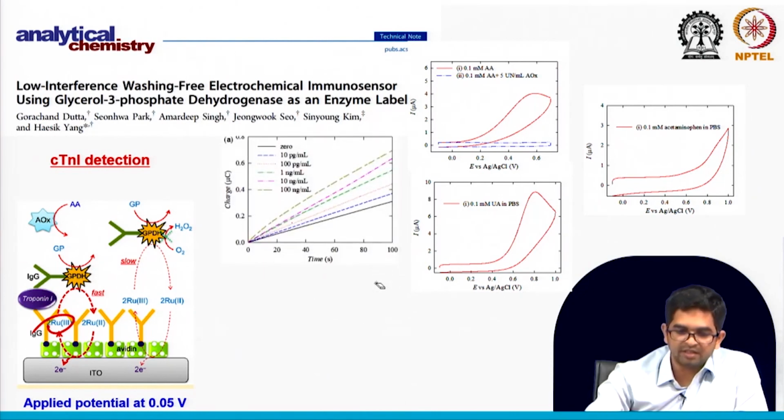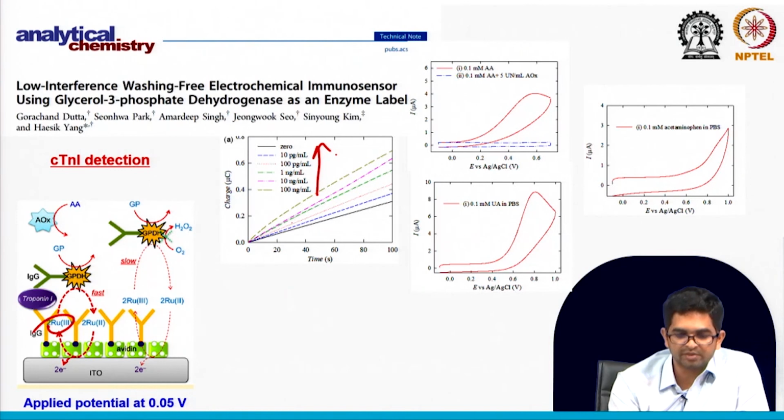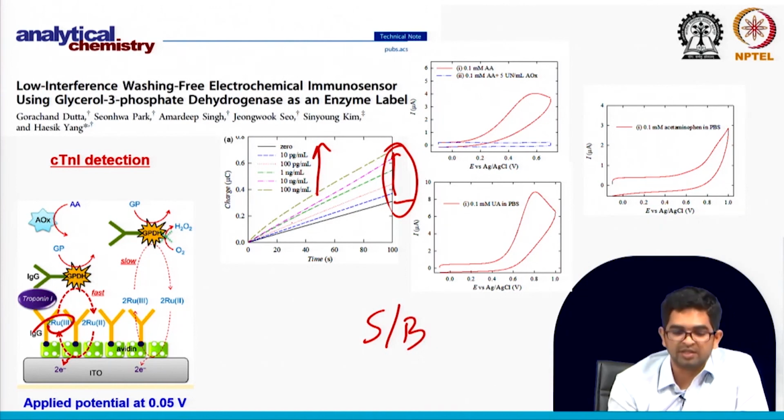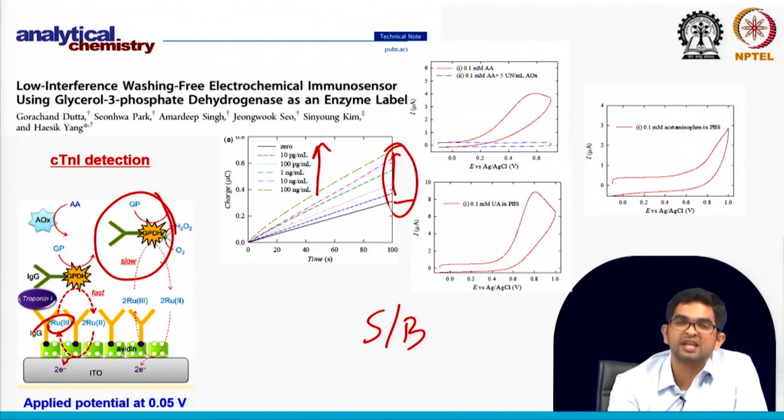See here some data. We measured different concentrations of the biomarker. But one thing you see: the zero data and the different concentration data, their difference is not so high. In the wash-free case, the signal-to-background ratio cannot be very high, because you already have your label in the same solution. We are differentiating just by optimizing different parameters.